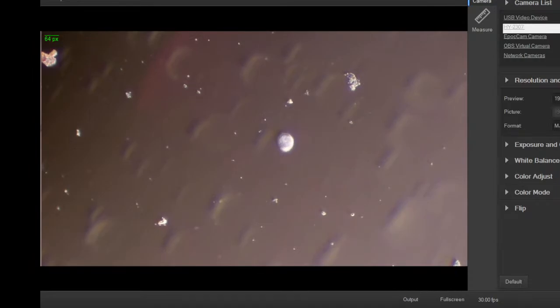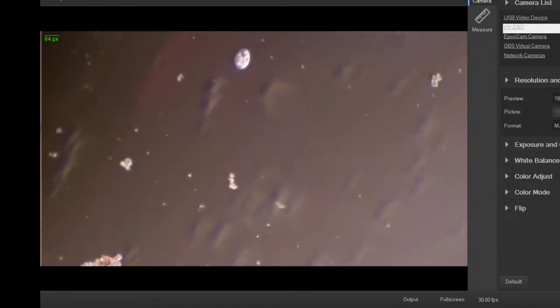Fast, it just likes to go in circles a bunch, so I can actually study it a little bit. You can see that pulse, that means the water is starting to recede from evaporation. This one's got some really sizable vacuoles in it. Look at that. It either ate a lot or something else is going on in there. Yeah, it's a kind of wobbly, crazy motion that gets the cats nuts.